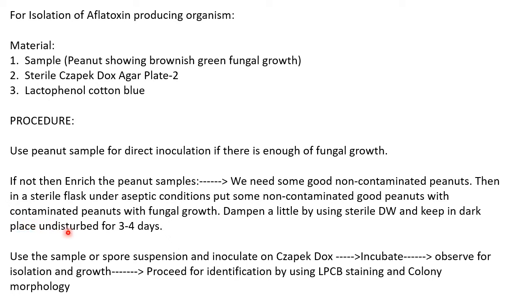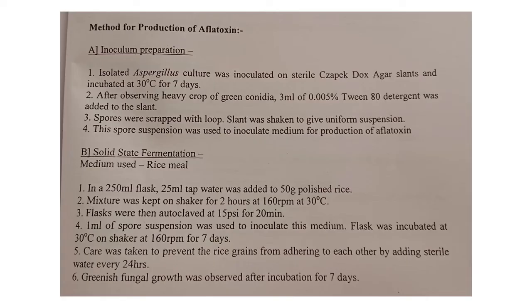After that you need to incubate and observe for isolation and growth. Now proceed for identification by using lactophenol staining and colony morphology. So this is about the isolation of your fungi.